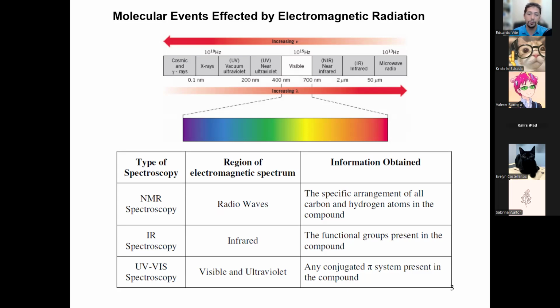Next semester, you'll use NMR to find out how many hydrogens are attached to carbons. Today, we're using IR. There is also another type of spectroscopy called UV-vis, ultraviolet visible light. Basically, that's just color. If you look at a carrot, it's orange. Why is it orange? Because it contains carotene, and carotene has ene double bonds. It is a UV and visible light active compound.